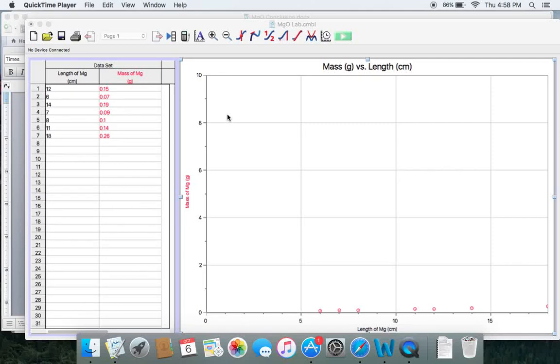The MGO tutorial on LoggerPro. I've skipped ahead to having all our data inputted already. We've got mass on the y-axis, our length on the x, and I've given the graph a title.